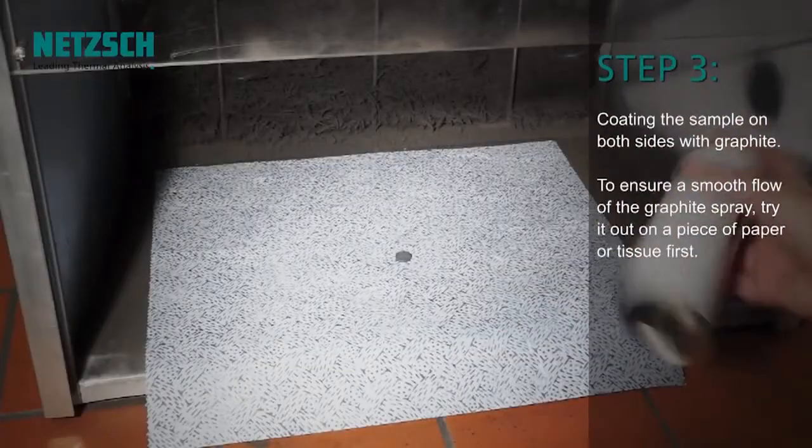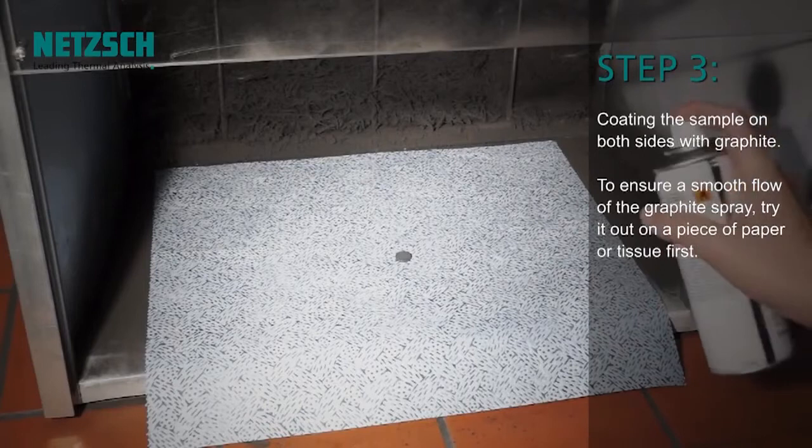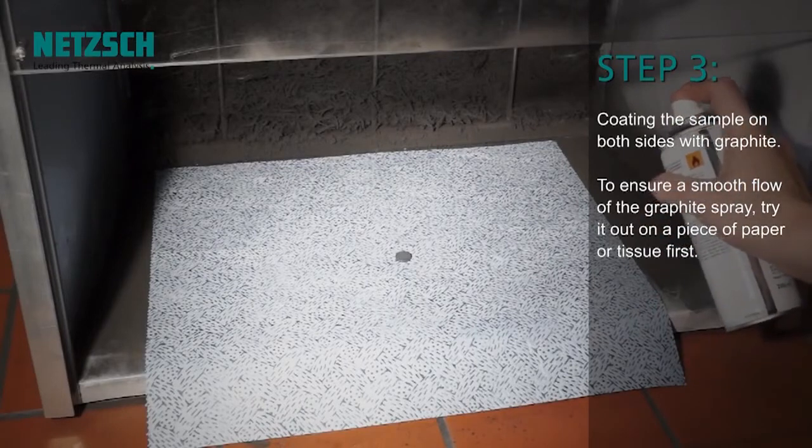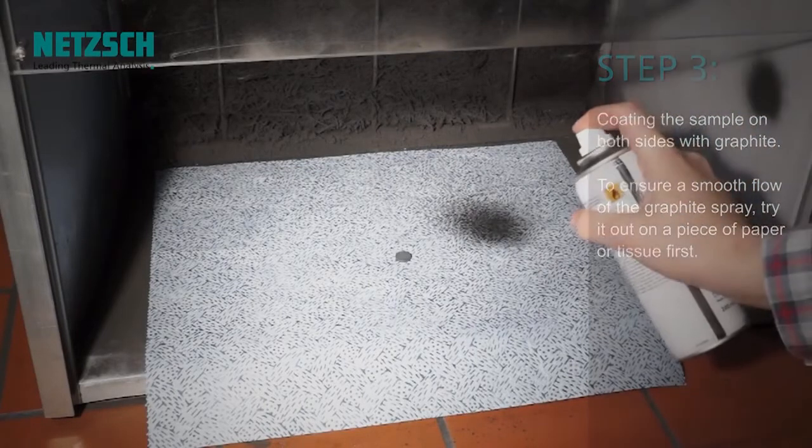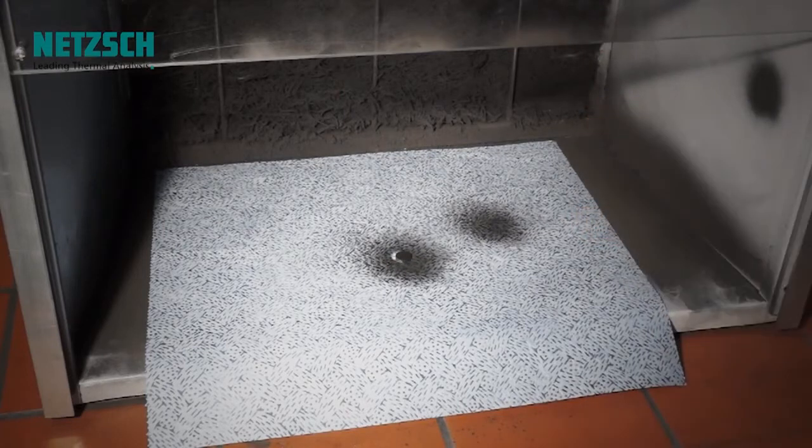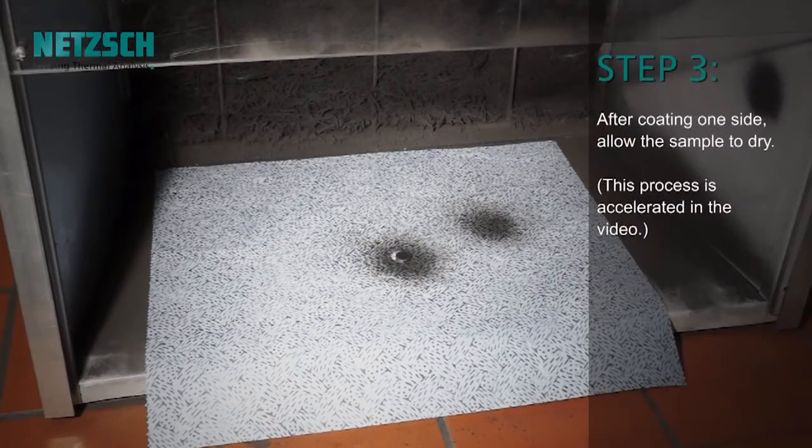Coat the sample on both sides with graphite. To ensure a smooth flow of the graphite spray, dry it out on a piece of paper or tissue first. After coating one side, allow the sample to dry.